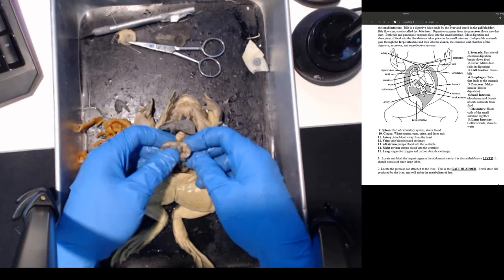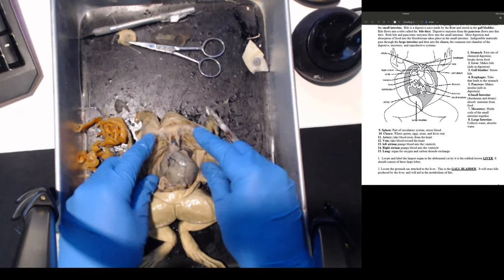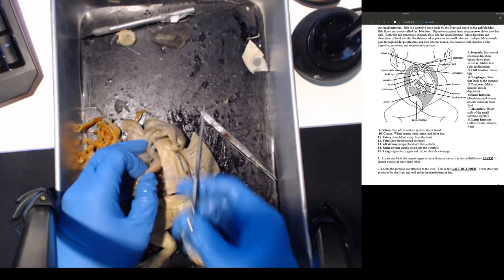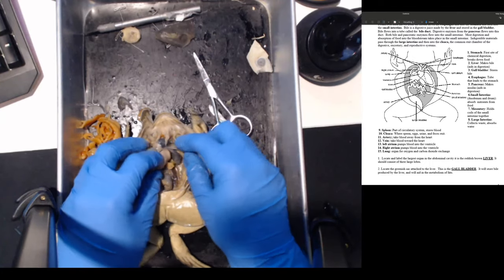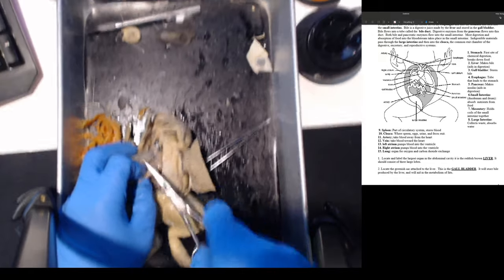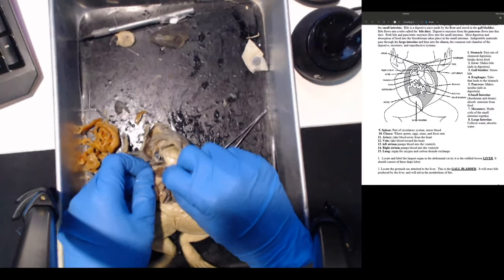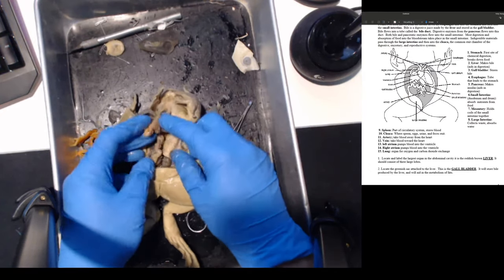You can see mesentery right here and all of this is just intestines - the intestines don't look that full, the frog maybe didn't eat much. At the back you can see some arteries - the red ones are arteries. Let's cut the stomach open and see what this frog has been eating. The stomach is harder to cut - it has a tougher tissue material. Inside the stomach - that's the food that's been digesting.